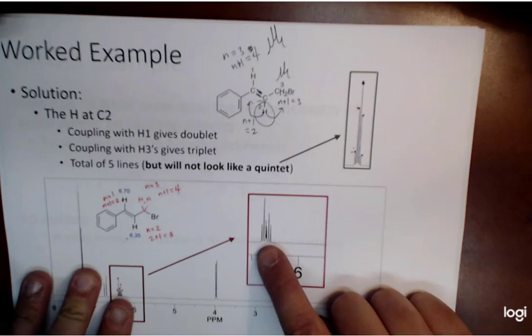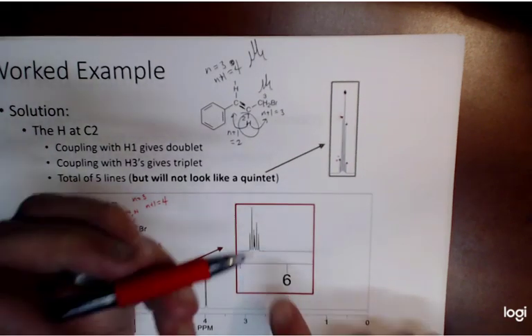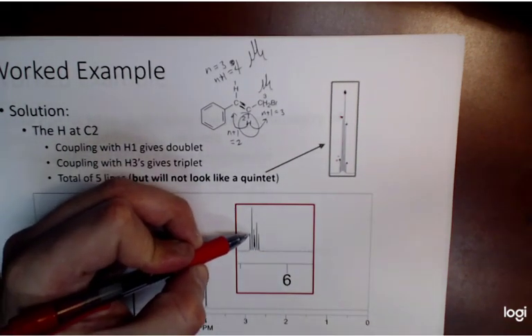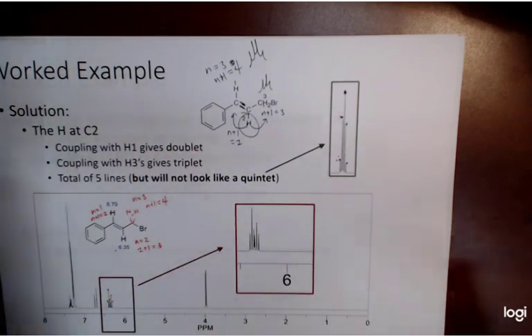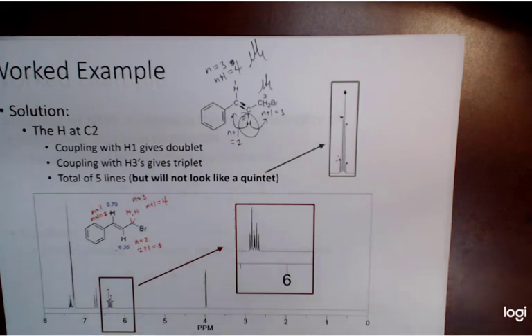And so here it is. It's a little bit easier to see, right? It goes up, down, right? So you do see that it's not symmetric, okay? Just making sure we do see that.